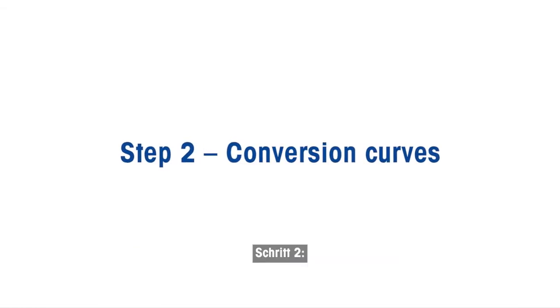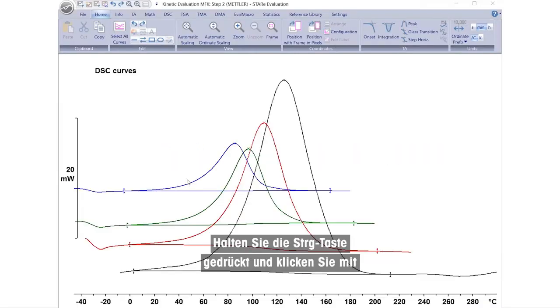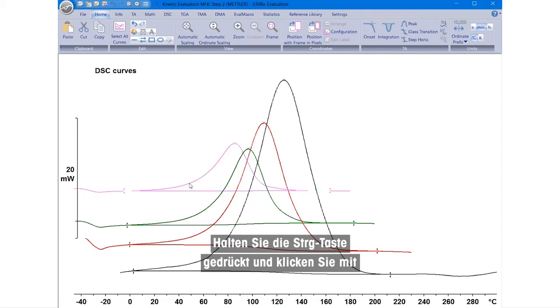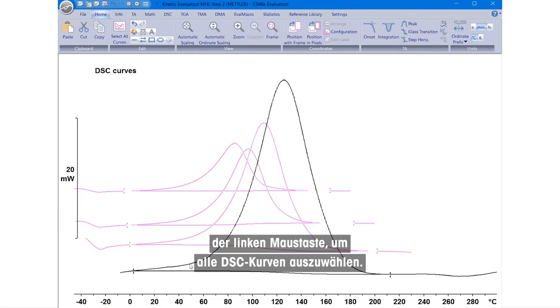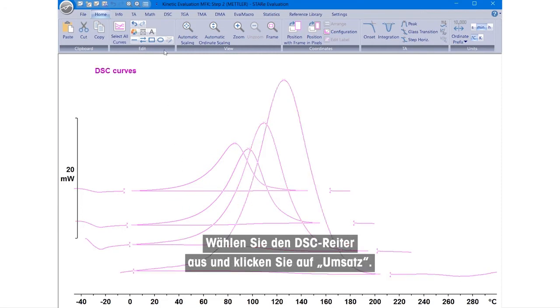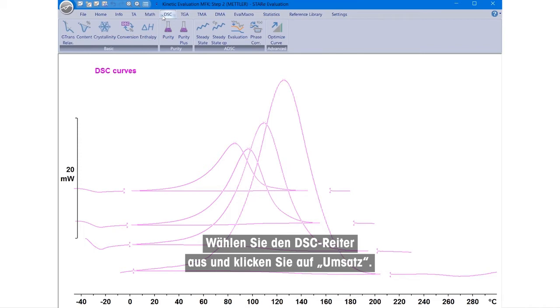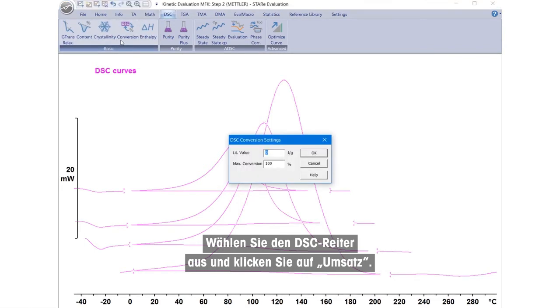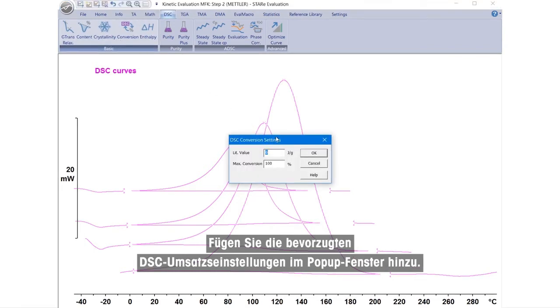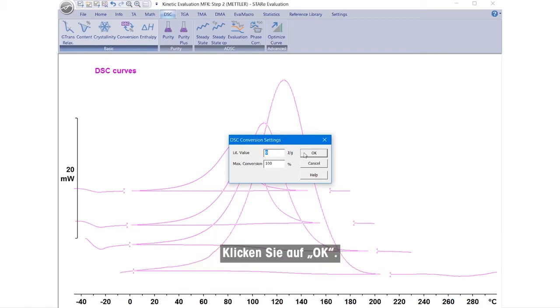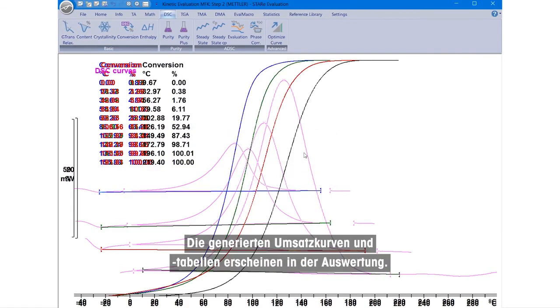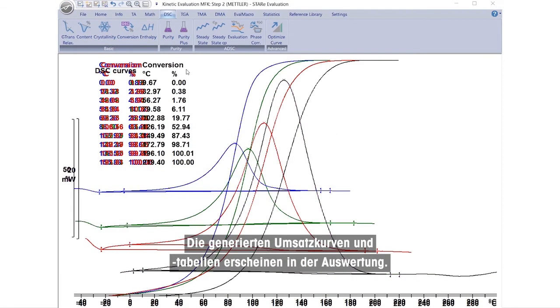Step 2. While holding down the Control key, left-click to select all the DSC curves. Select the DSC tab and click on Conversion. Add the preferred DSC conversion settings in the pop-up window. Click OK. The generated conversion curves and tables will appear in the evaluation.